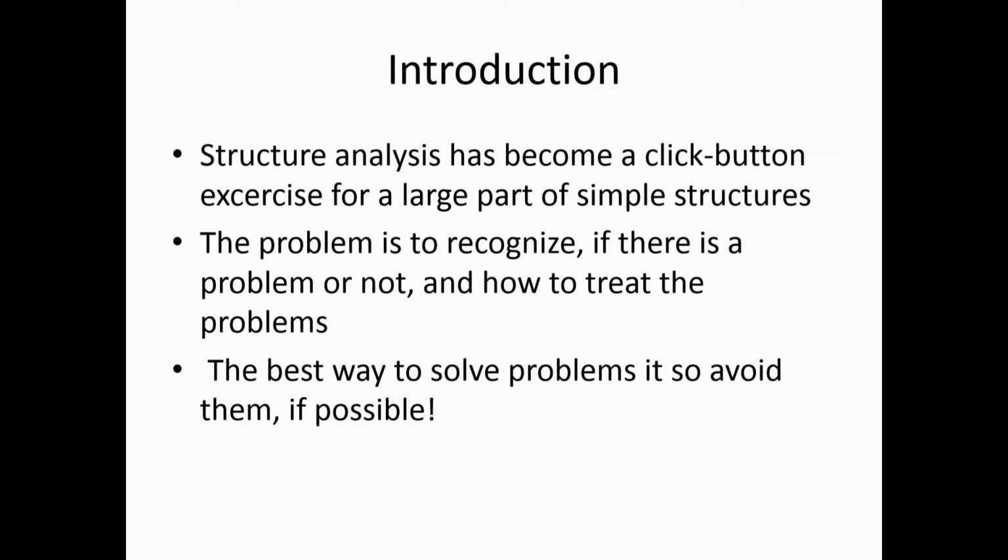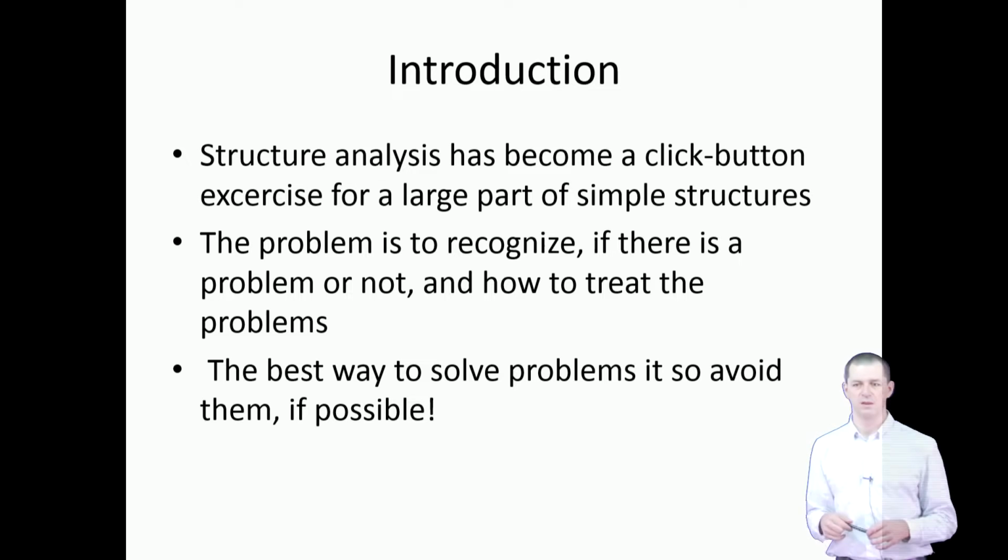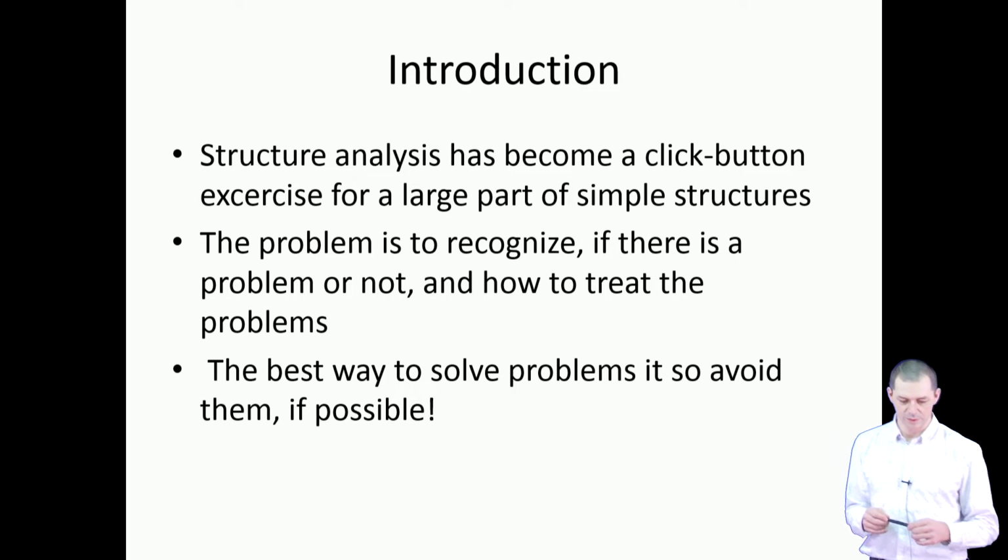However, your task as a crystallographer is to recognize if there is a problem. That's already not so trivial. There are cases where it's obvious, but there are cases where it's not so obvious, and it's important to recognize these problems. And then, of course, if there is a problem, then the real job starts, and you need to know how to solve it, correct, and still obtain a good and reliable crystal structure.